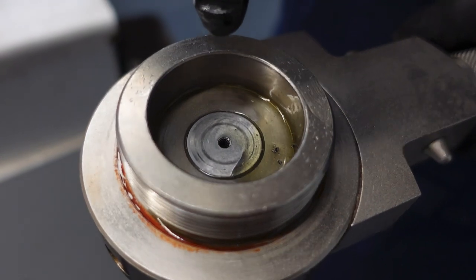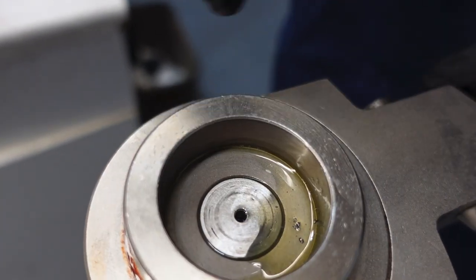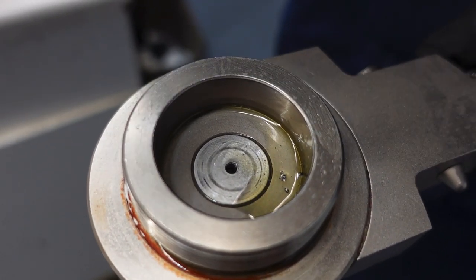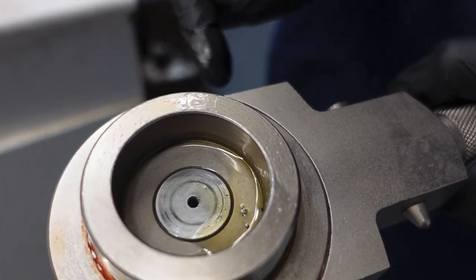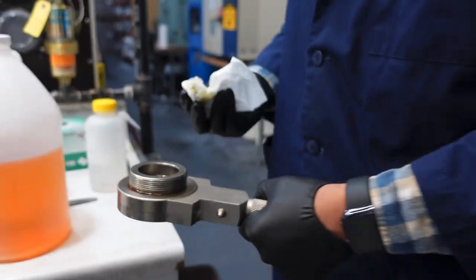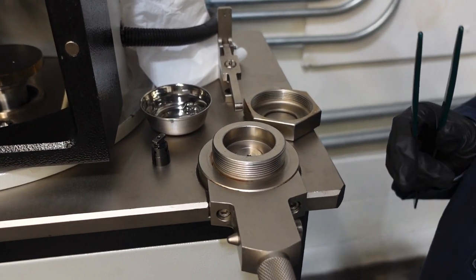Especially if you have something like a recirculating oil system — not so much in a chainsaw, but that's going to foul all the little nooks and crannies along the chain. You know, that chain's coming back in through the machine and going back out again, and all that stuff comes with it. So it accumulates. We're going to now run the DeWalt product.